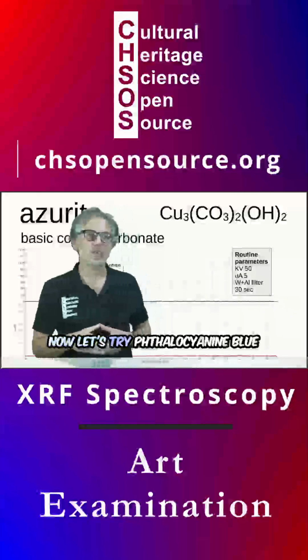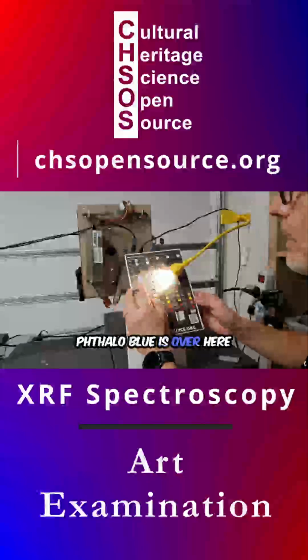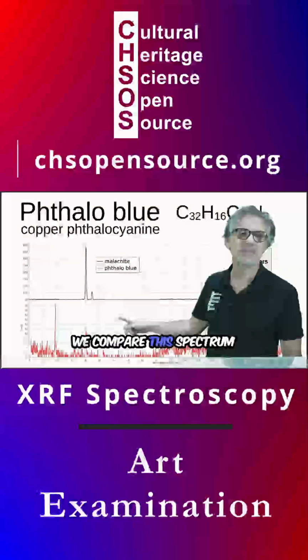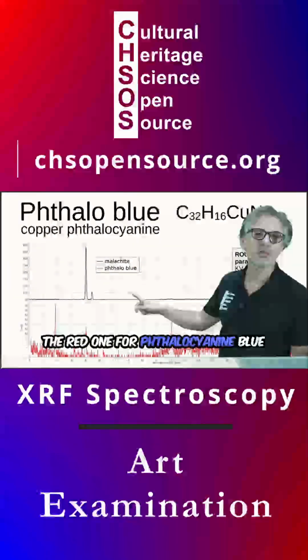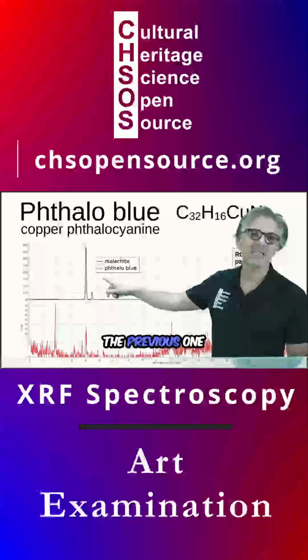Now let's try phthalocyanine blue. Phthalo blue is over here, there it is.